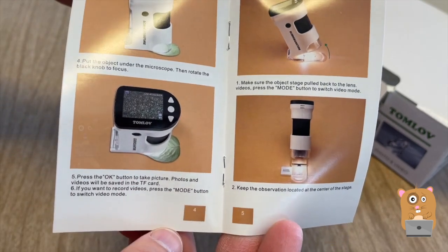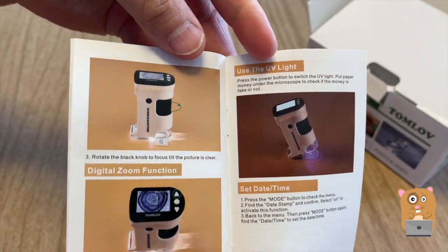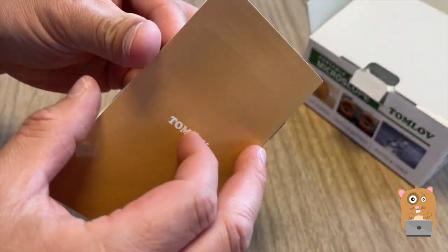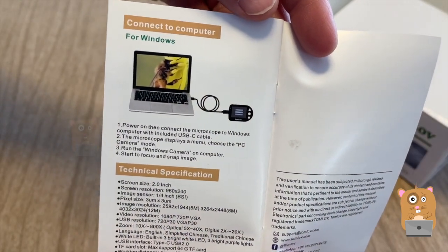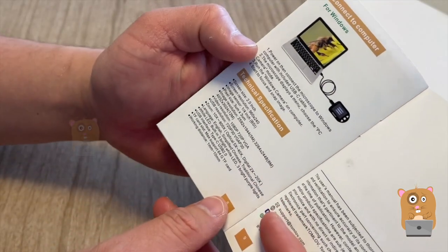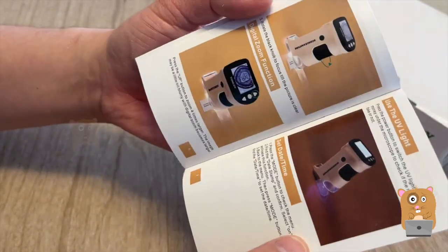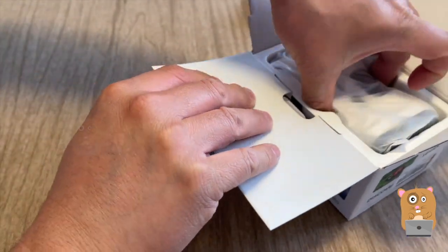I'm showing some pages from the user manual. If you want to read any part of it in more detail, feel free to pause the video. This can also be connected to computers, but this one just says PC — Windows computer though. My computer is a Mac, so I'll work that out later.